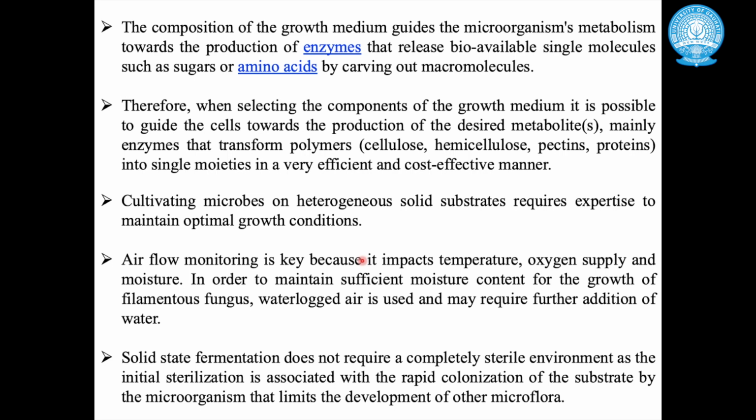In order to maintain sufficient moisture content for the growth of filamentous fungi, waterlogged air is used, because fungi primarily grow under hot and humid conditions. So you need to maintain those things.